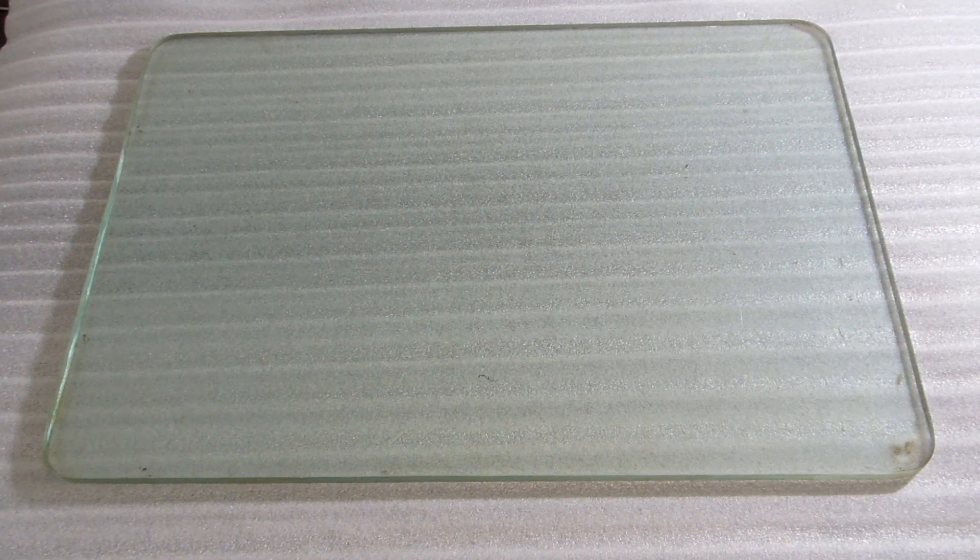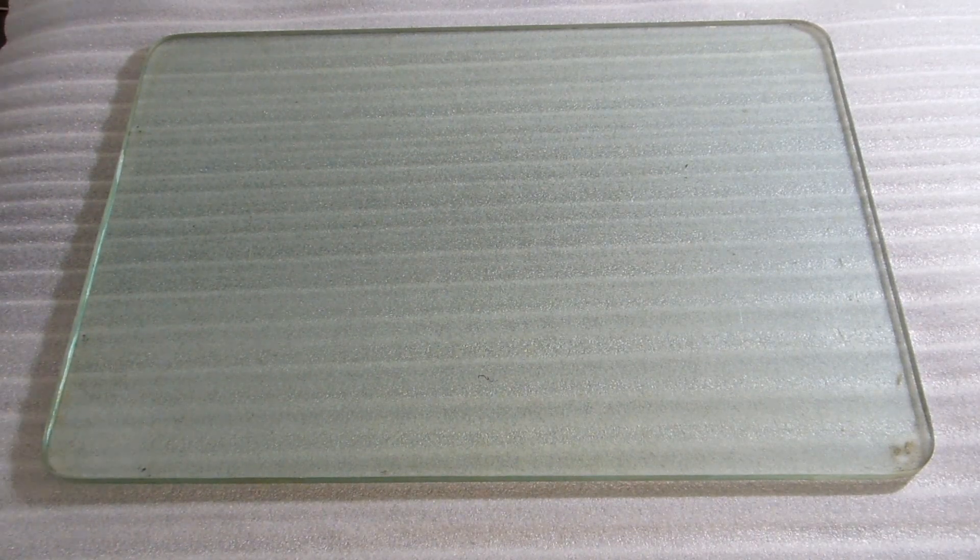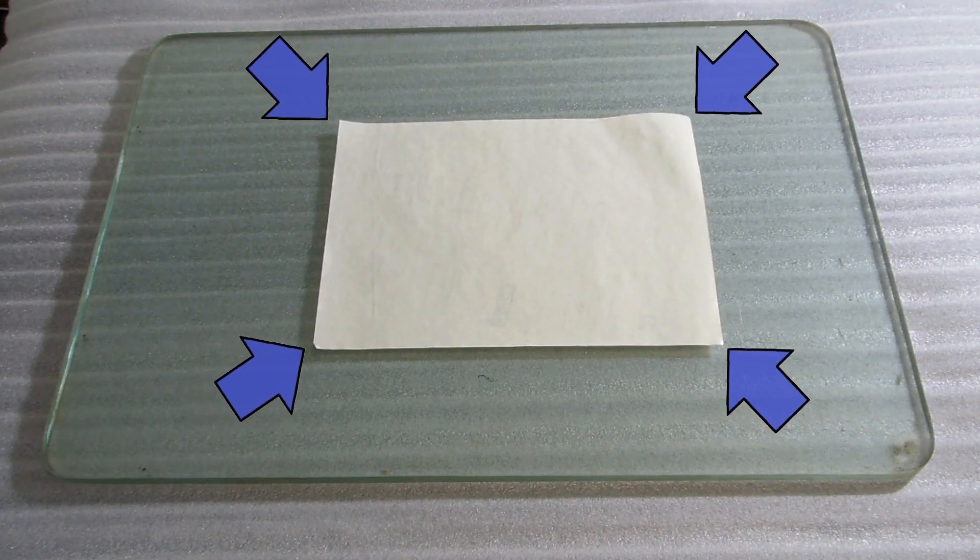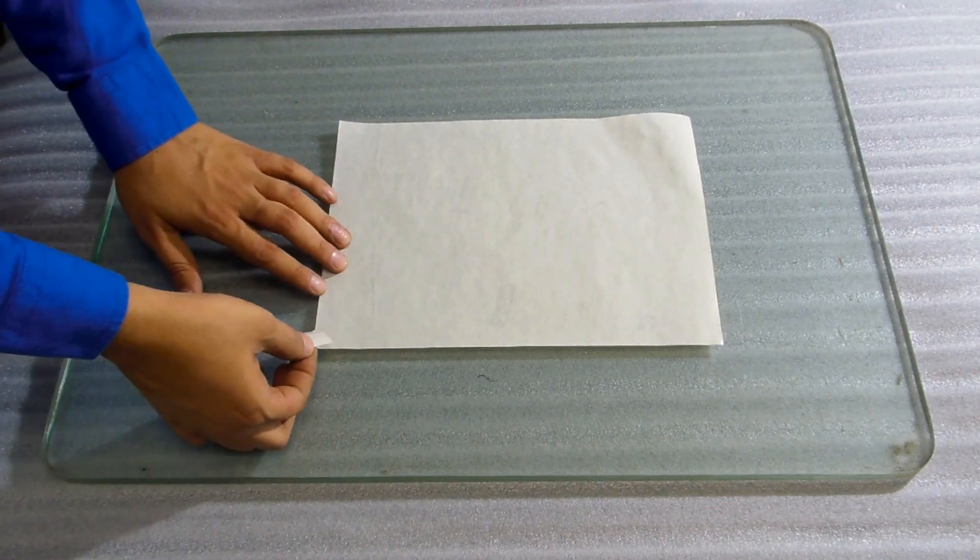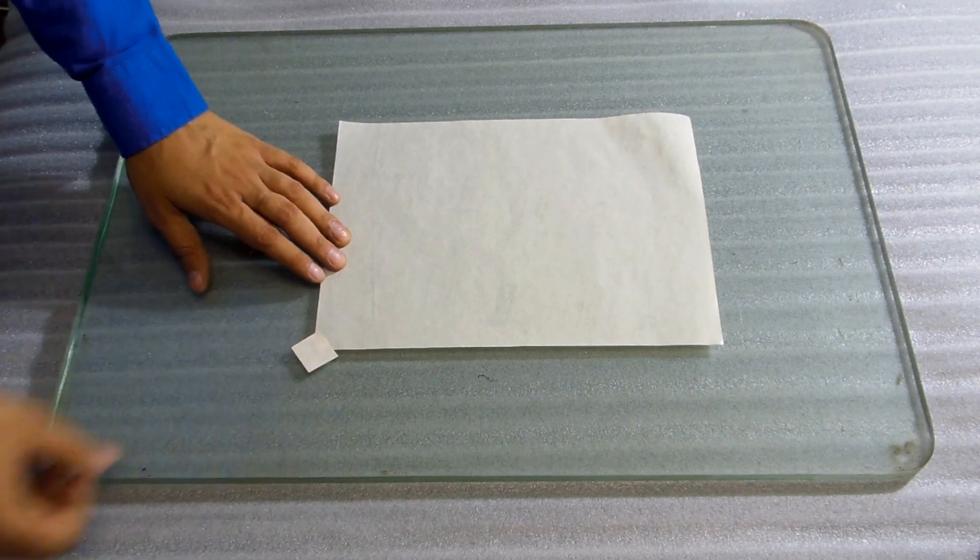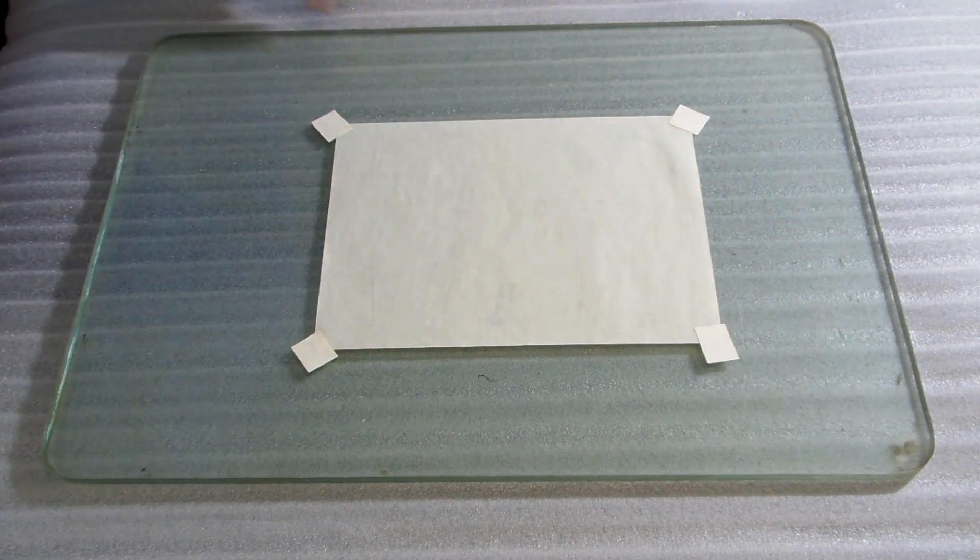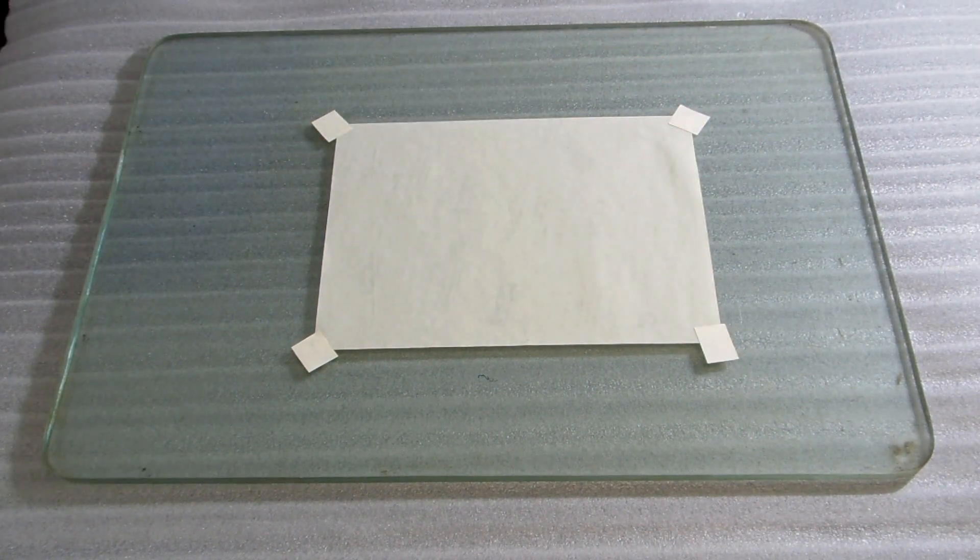Place a sheet of silicone release paper. Apply pieces of adhesive tape to hold the paper in place. Discard the top 3 to 6 layers of the tape.